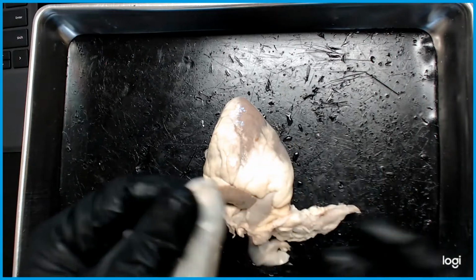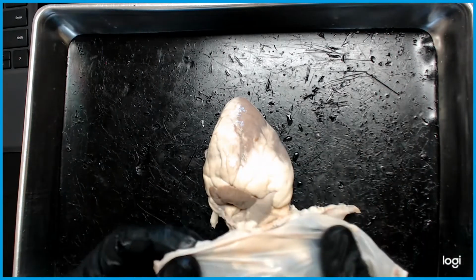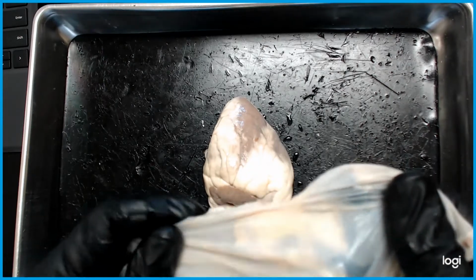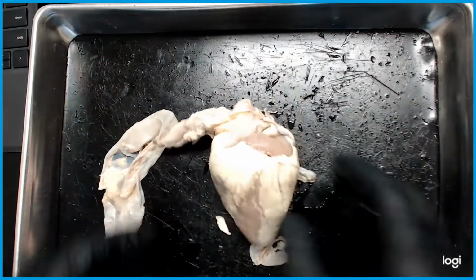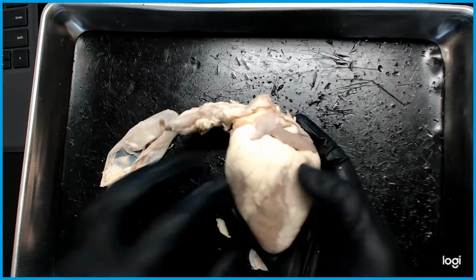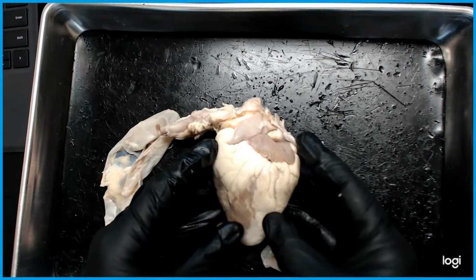This is a pericardium. Do not confuse a pericardium with a layer of the heart. Some students do tend to confuse it and think the pericardium is a layer. It's not. As we're seeing right now, it's a pericardium. This is on the outside. As we do the incisions, I will show you the myocardium and the endocardium.